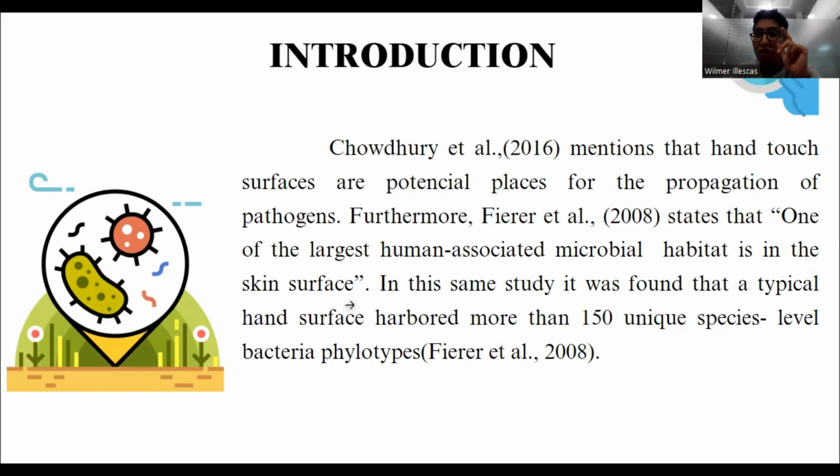The last part, which was so interesting to notice, was that in one piece of research, the researcher swabbed two hand surfaces, and then noticed that they had unique species, and in one place and the other they were the same microorganisms. It was so appealing to see this result.